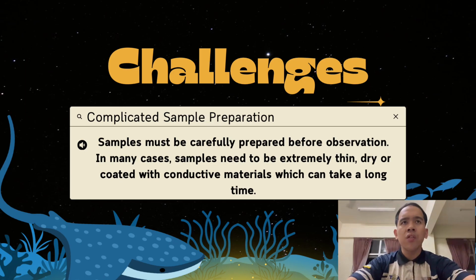Another challenge is complicated sample preparation. Samples often need to be very thin, dry, or coated with conductive materials before observation. This preparation process can take a long time and requires careful handling.